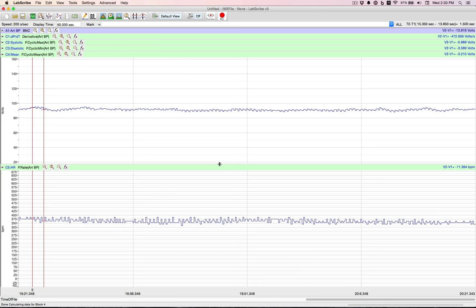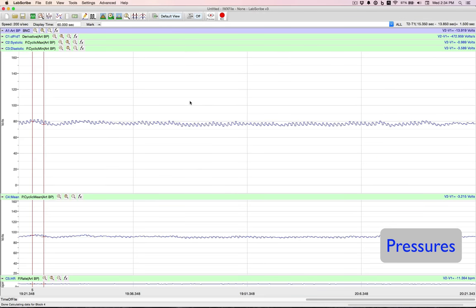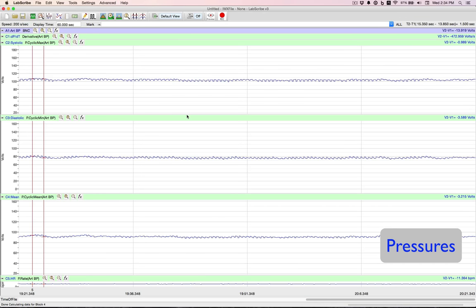Another option may be I just want to show some pressures. So again, I'll readjust some of these channels. So now I have my mean, my systolic, and my diastolic. This time I'll make it 10 seconds.